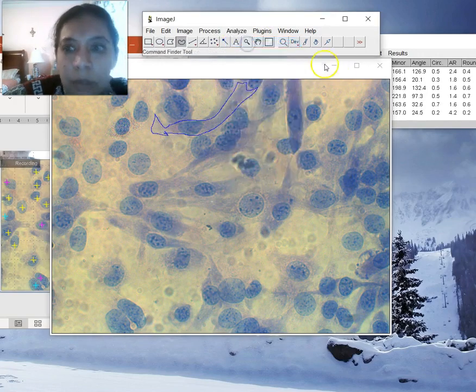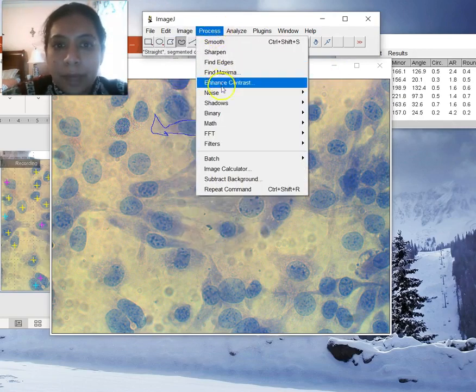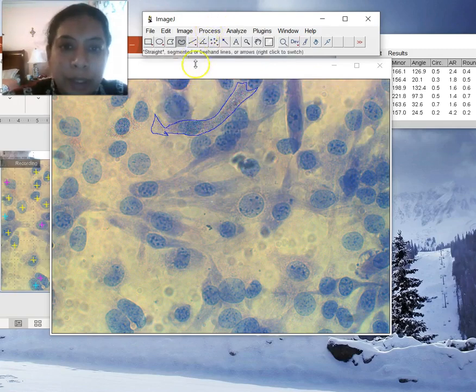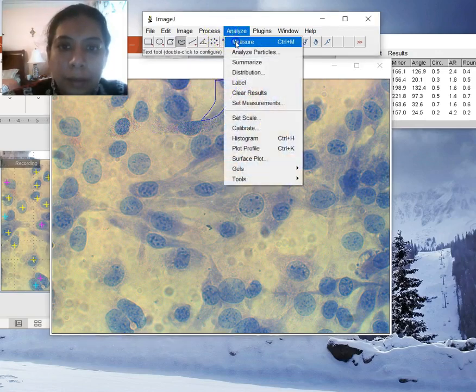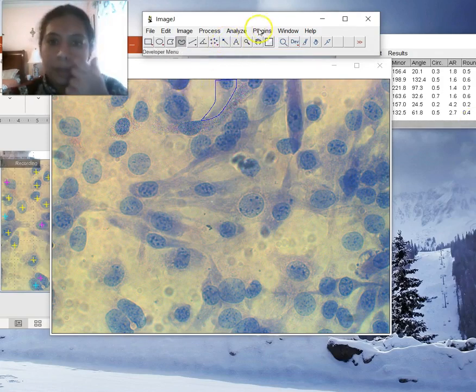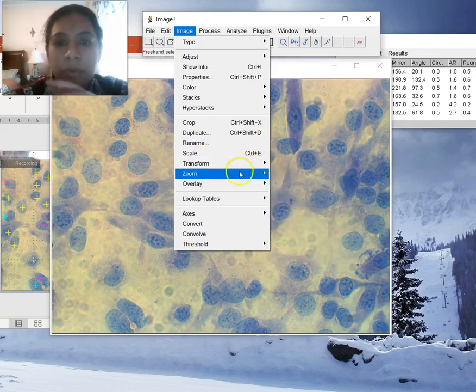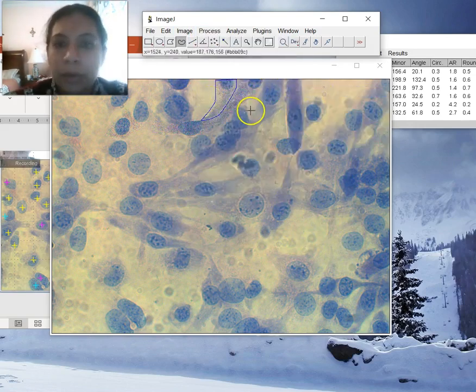So sometimes you cannot quite see the boundary, and that's okay. Again, adding that noise helps you figure out where you've already counted a boundary, so you don't redo it again, right? So this one is just a partial cell, but it's clearly elongating. So I can still kind of look at it. If it was one that I wasn't sure, I would just let it go and not do it. Again, add noise as I go, right? So that's how you would keep track of your numbers.